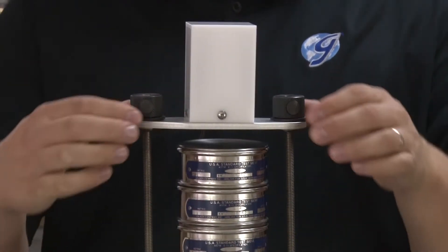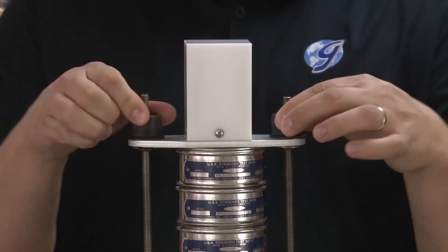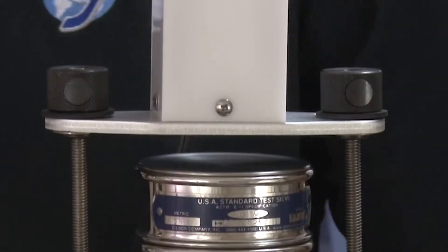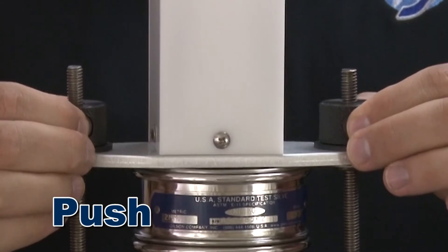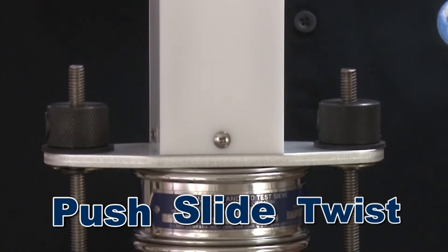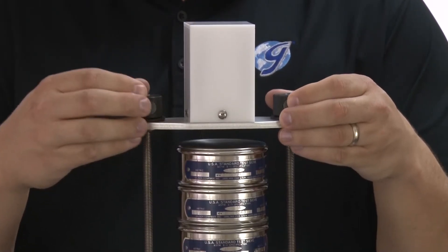Securing the sieves is as easy as pushing a button. Gilson's easy clamp system effortlessly slides up and down with no cumbersome knobs to work with. To secure the sieve stack, simply push the release button, slide the clamp assembly down to the sieves, release the button and twist to tighten. To release, simply push the button and lift.